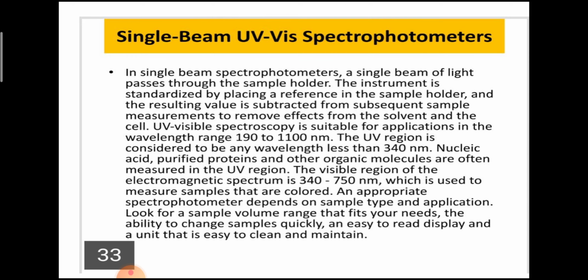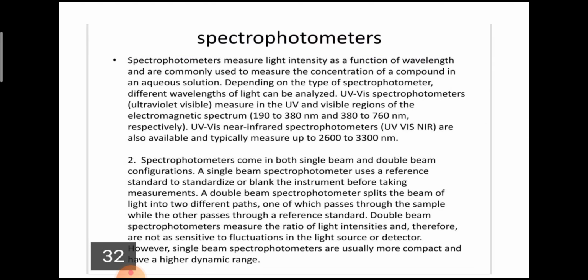An appropriate spectrophotometer depends on sample type and application. Look for a sample volume range that fits your needs, the ability to change samples quickly, an easy to read display, and a unit that is easy to clean and maintain.